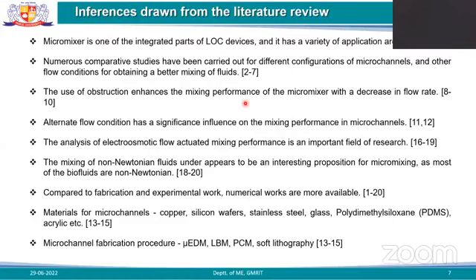The microfluidic micromixer is one of the integrated parts of LOC devices, and it has a variety of applications. Numerous comparative studies have been carried out for different configurations of microchannel and other flow conditions for obtaining better mixing of the fluid. In the case of a passive micromixer, the modification is only in the channel geometry or curvature. We can add some obstacles or ribs, or we can change the flow path, and then we also get better mixing.